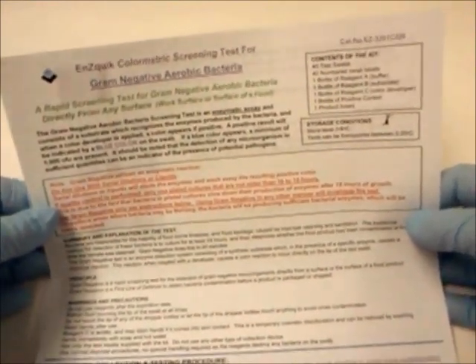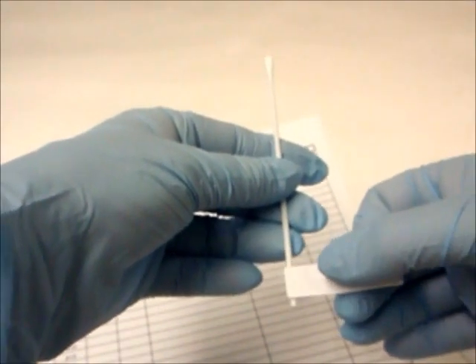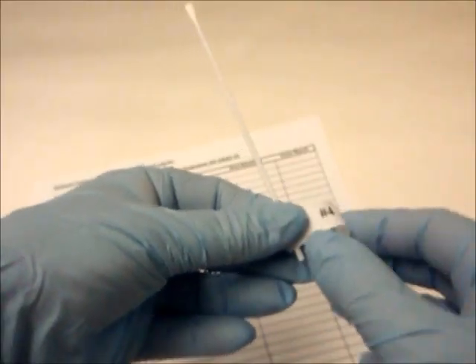Always follow the instructions enclosed with each kit. First, use a data collection sheet to record information related to the test site, which corresponds to each numbered sample. Place the numbered tags onto the swabs to be used. Tests can be performed individually or in batches.